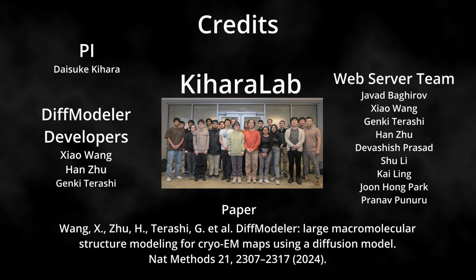In conclusion, DiffModeler is a very powerful tool to assemble protein complexes from cryo-EM maps at resolutions other tools often struggle to. For more information, please check out our tutorial for more detailed instructions, or if you want to learn more about the tool, you can read our paper at Nature Methods.